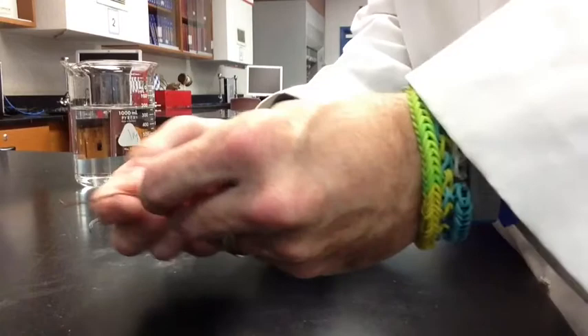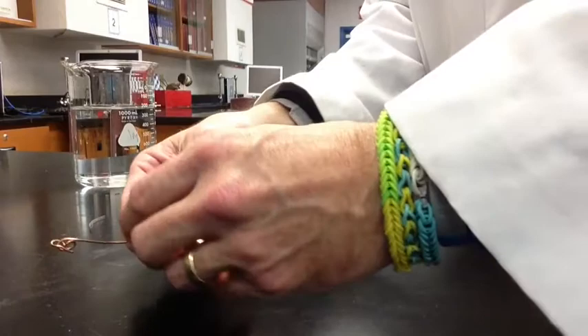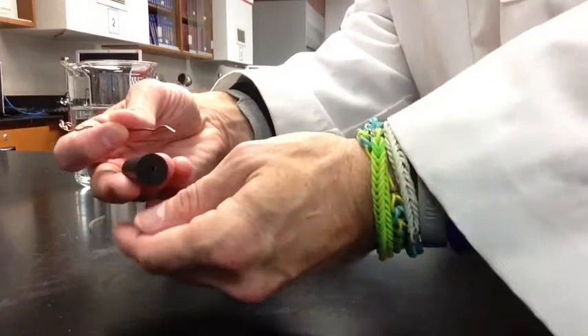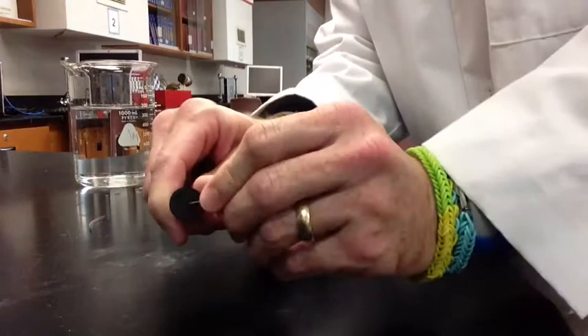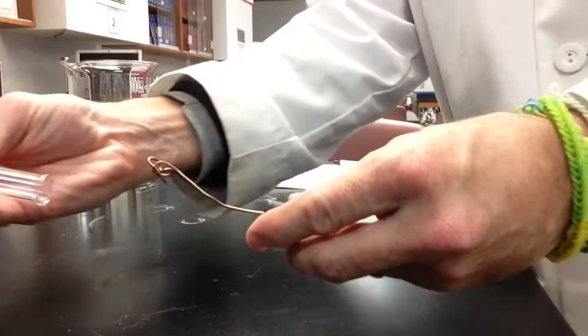Once you have that, you're going to have your piece of copper wire, and you're going to make a cage at the end if one has not already been made for you. You're going to have a stopper, and you put it through the stopper so that the cage is sticking out the thin side of the stopper. That way it'll fit into the eudiometer. Once you have it into the stopper, you're going to bend the end so it holds it in position.